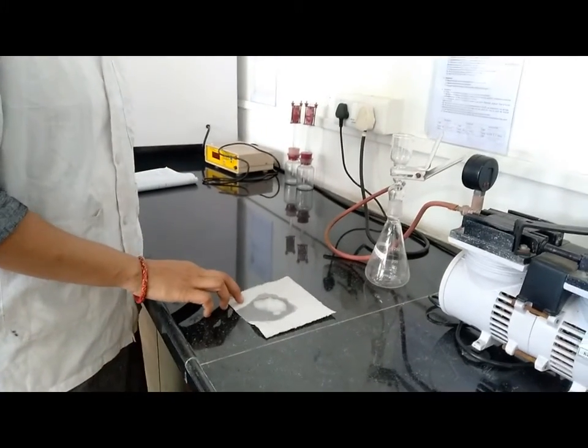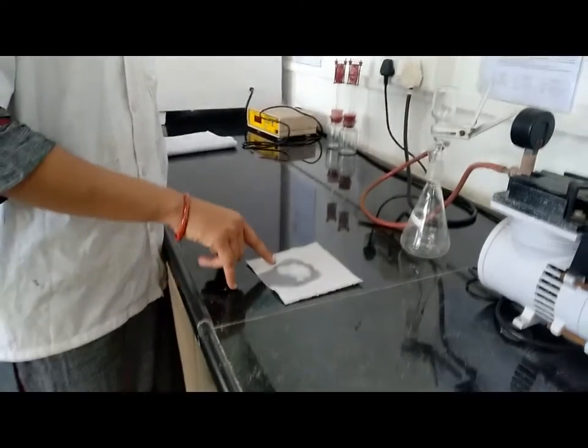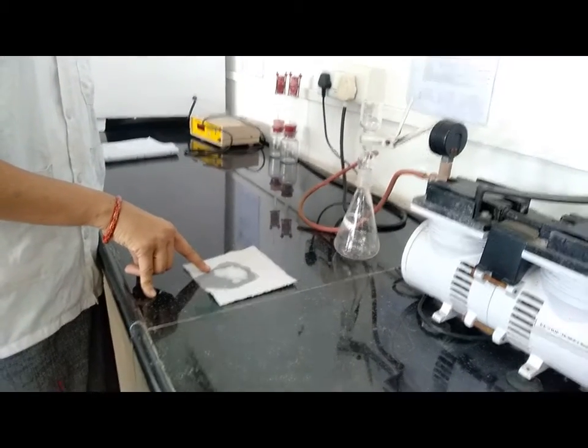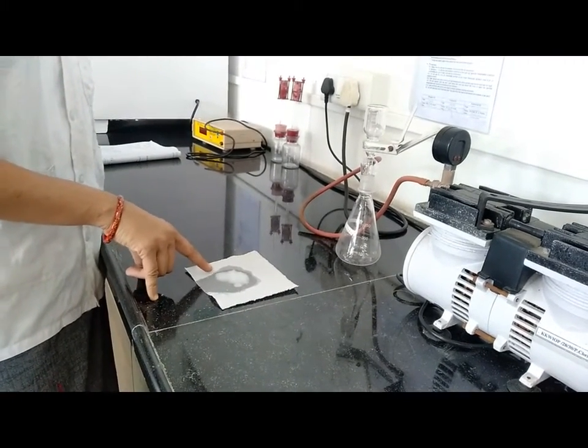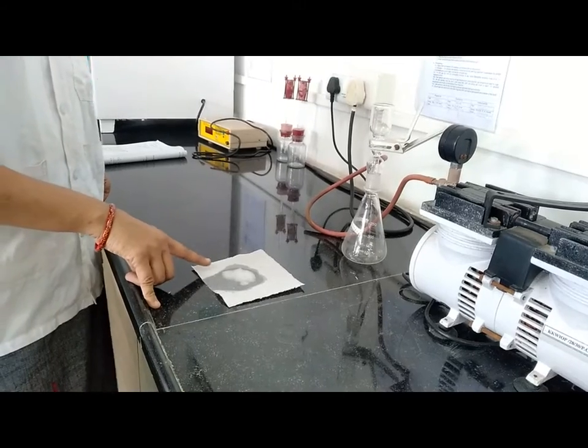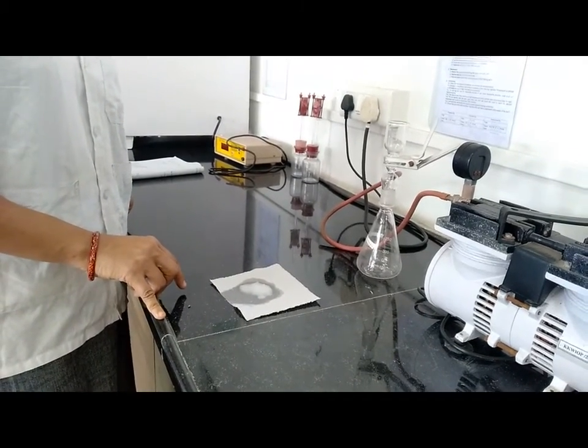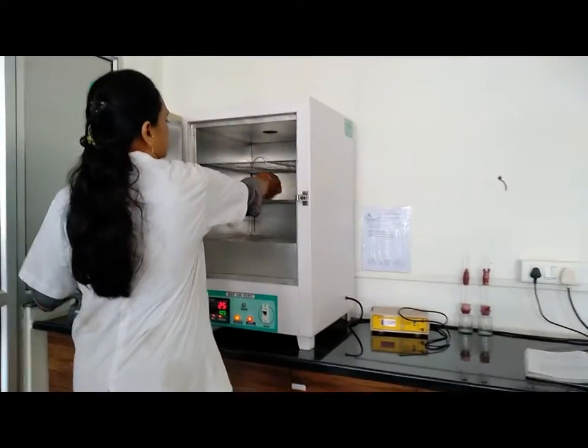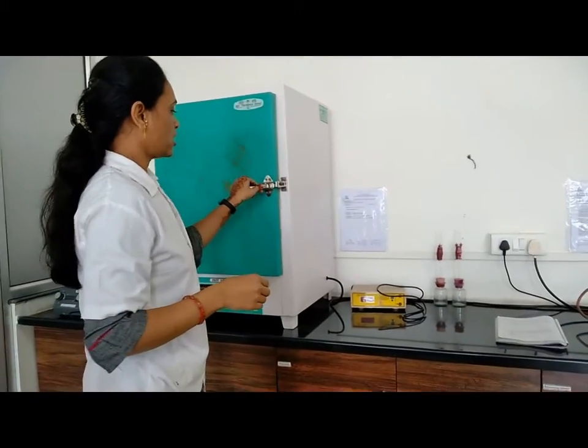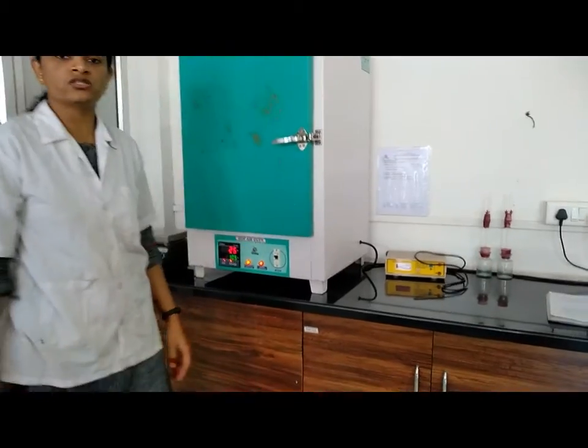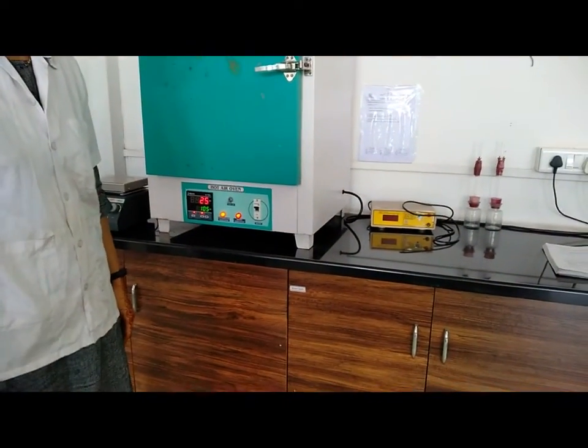By using the filtration pump we get such type of white color precipitate. Now this precipitate we have to dry at 105 degrees Celsius in an oven. We have to put it into the oven and dry it at 105 degrees Celsius so that we get dried compound.